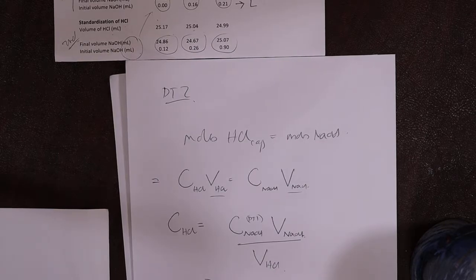So give that a shot. Bring stuff up in discussion if you have any problems with that. But I want everybody in this first week to get the concentration of HCl for their particular data set. There are 6 data sets. I'll send you all something different. Yes, feel free to talk to each other, but essentially, you're going to hand in your own lab on this one. So try and figure it out. All right, let's stop there. I'll get all this posted.